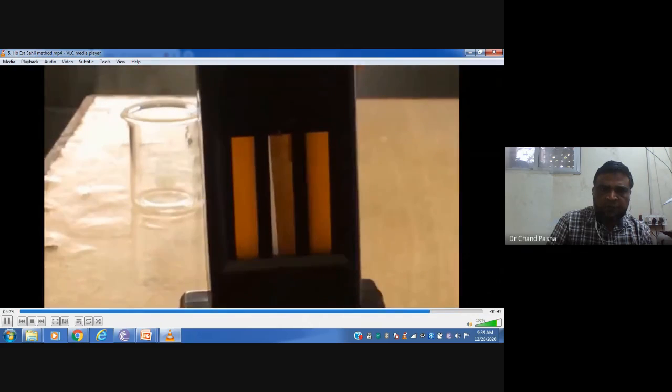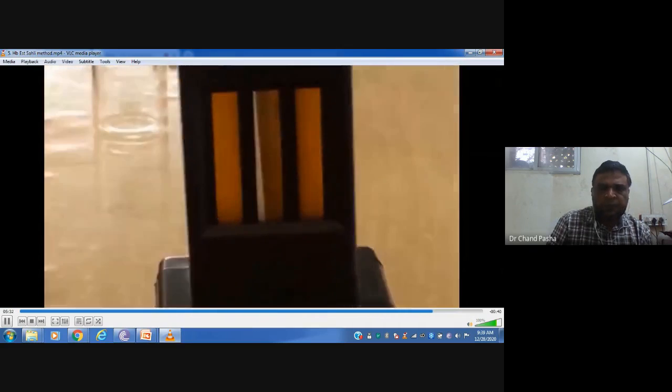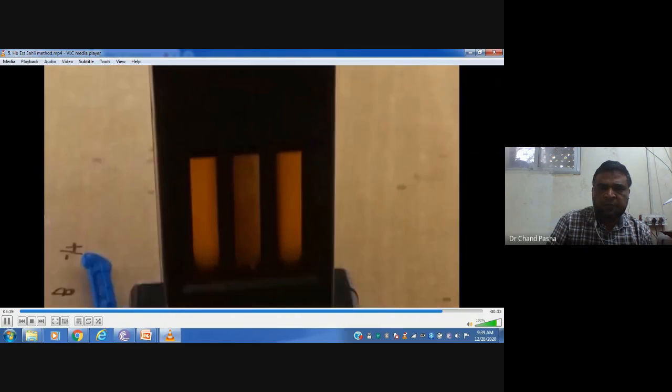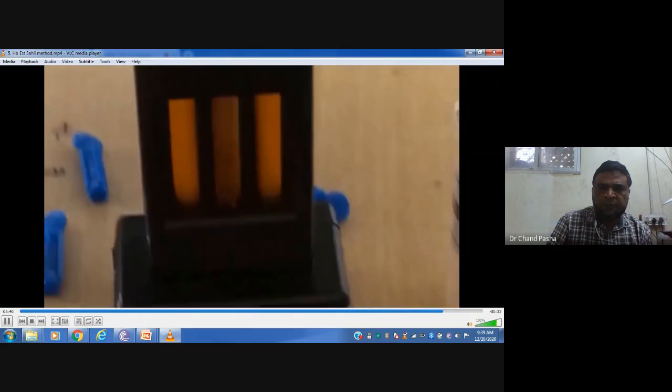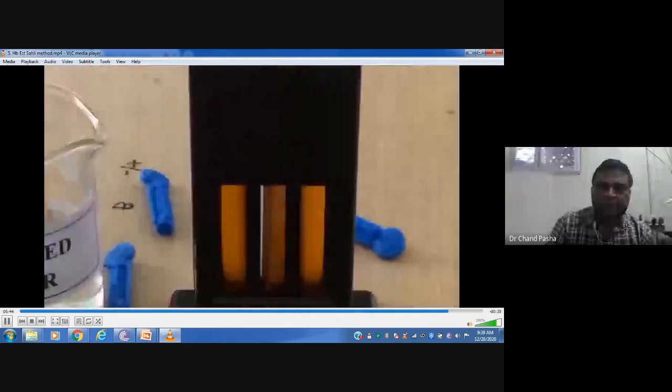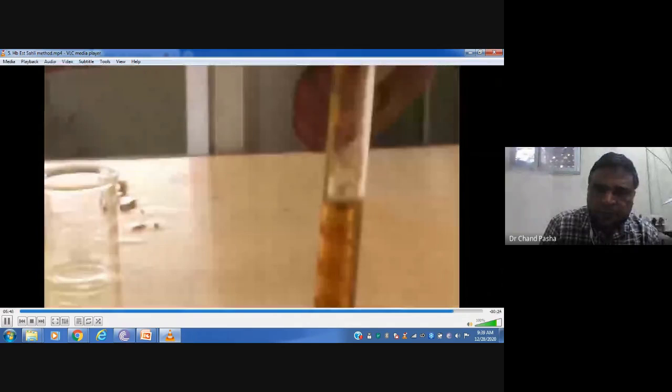See, now it is matching. Once it is matching, see either grams in grams or percentage. Matching perfectly. We'll take it out and we'll see how much percentage it is contributing.